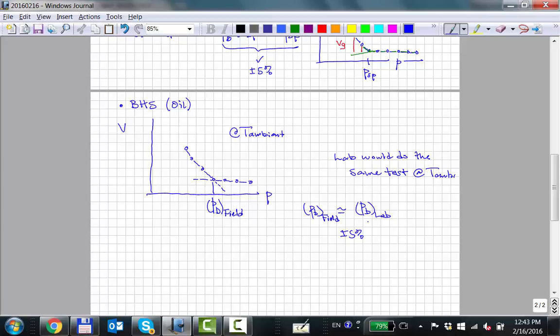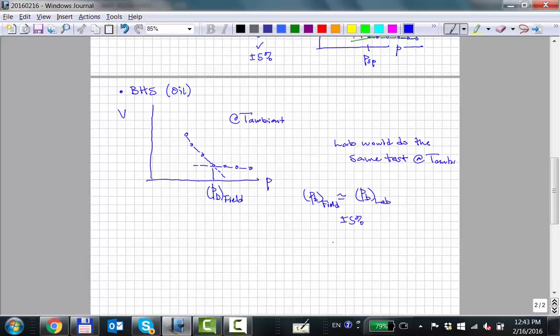And that was the QC. So if the bubble point in the lab was enough lower, that would say there was leakage in the transportation. And probably you have multiple bottom hole samples so that maybe one of them didn't leak, and you'll end up with at least one valid bottom hole sample. So that's the QC for oils.